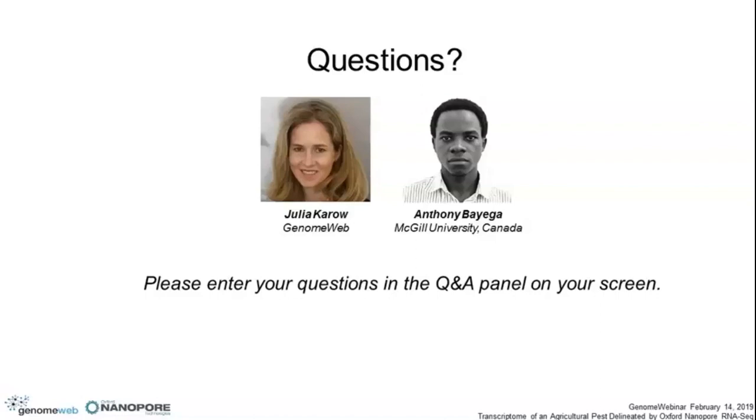I hope I answered that. The other question was Canu. How do we check for chimeras? If you use AlignQC, it will tell you what percentage of your reads have chimeras, and you can just take those reads out of your data set and not use them at all. But you can use other tools that find chimeras and will basically split them. I forget the tool, but I think it's Cutadapt that you can use to trim adapters from reads, and also find adapters that are in between your reads, which sometimes represent the chimeras, and it will just split the read into two if you tell it to. I hope I answered that question.